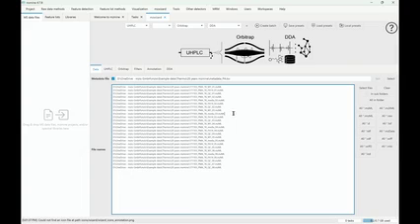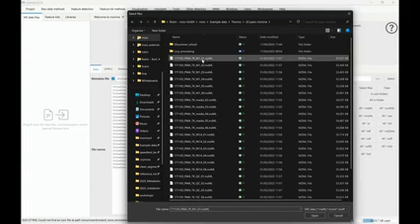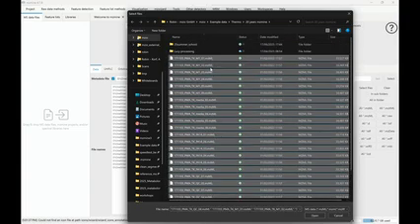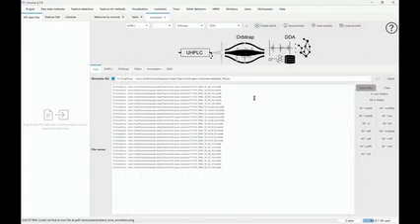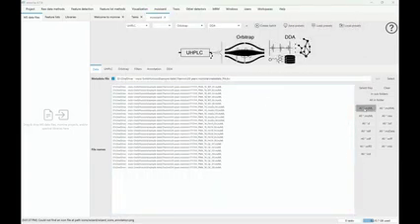Okay. And then in the same folder, there's actually the raw data files. You can always just go on, for example, select files, and then you're going to have the screen here. So I can just select with Shift, for example. I can Shift select all the files and say open. Or sometimes I feel it's easier to just click on all mzML files.